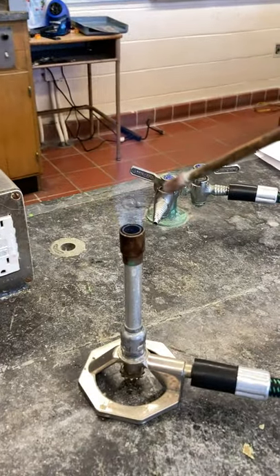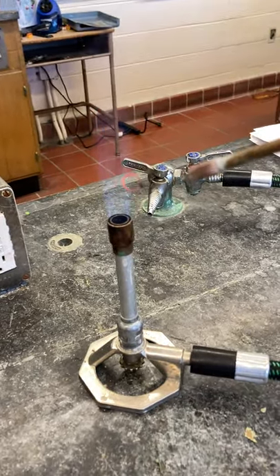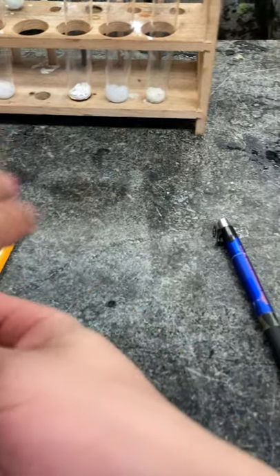Just look at the middle bar, though. The middle just burns. It has a red color, and then just instantly cools off. That's scary. That's very sus, bro. All right, so sodium is orange. Medium intensity. So we got orange, medium intensity.